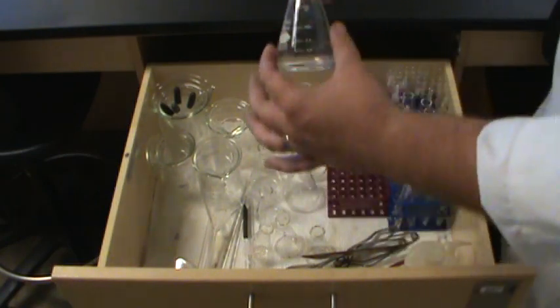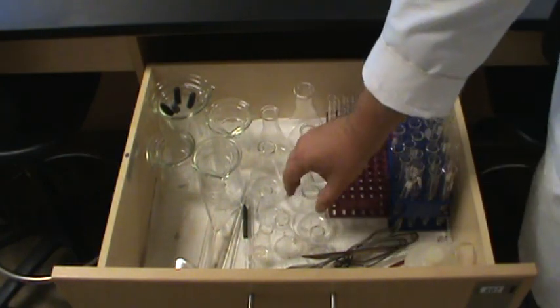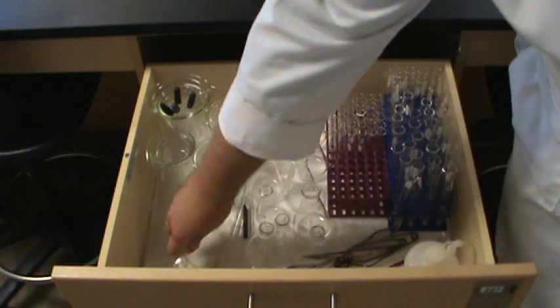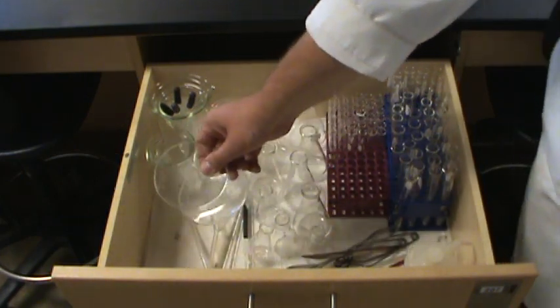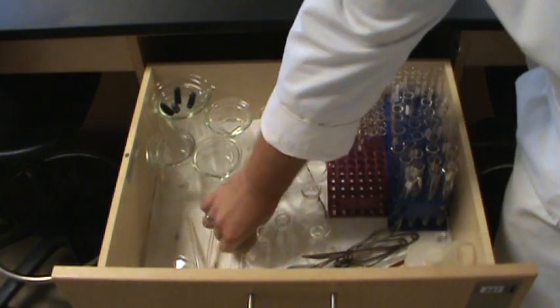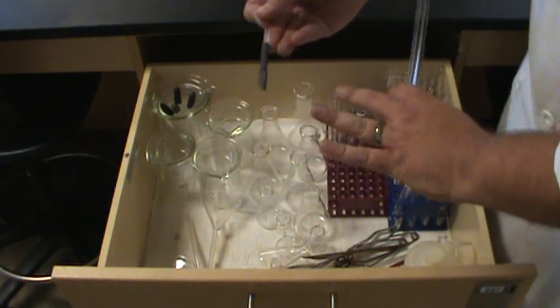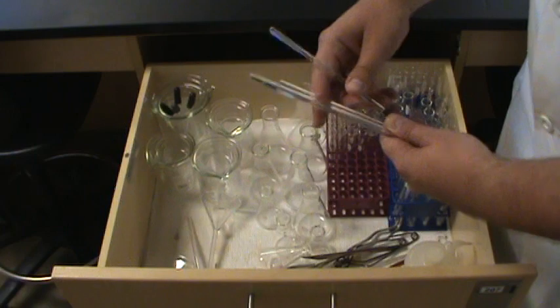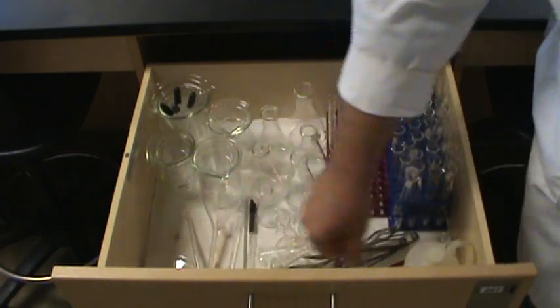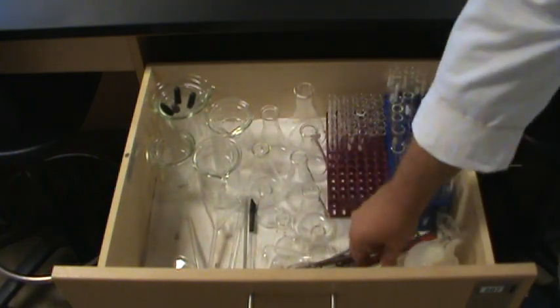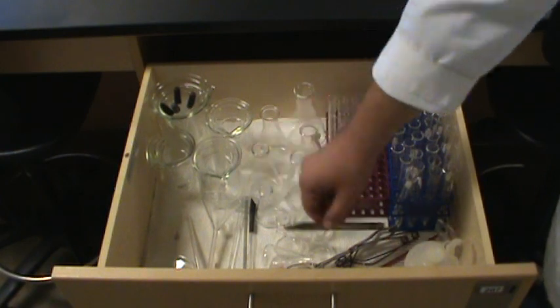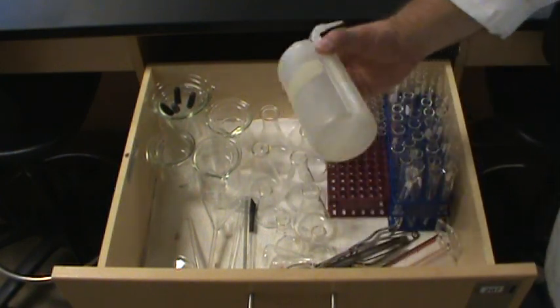Erlenmeyer flasks, those are the cone-shaped flasks, a couple of funnels that'll help us out, some watch glasses, stir rods and a rubber policeman that works like a little spatula for getting solids out, a couple of graduated cylinders, some other spatulas, and a water bottle.